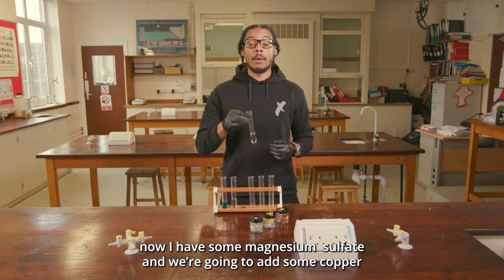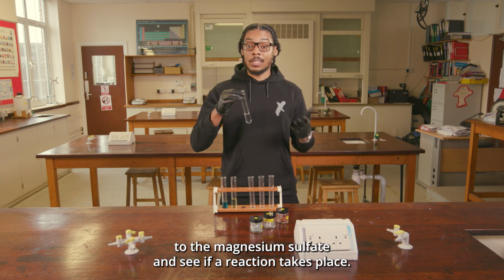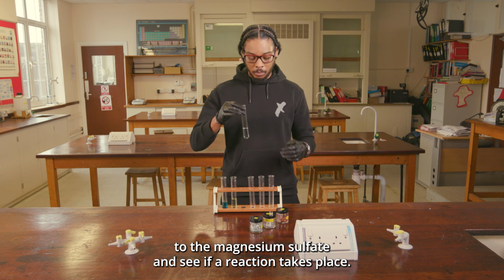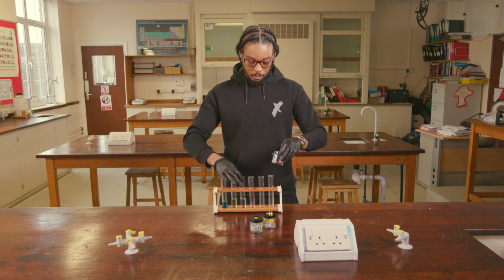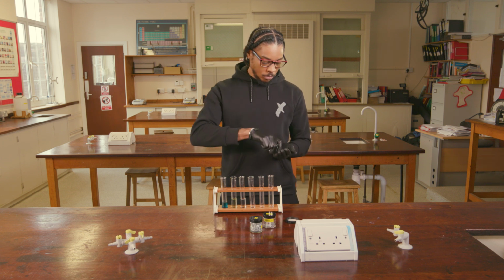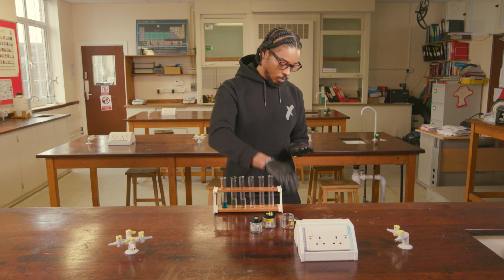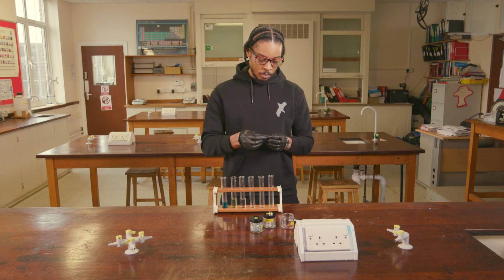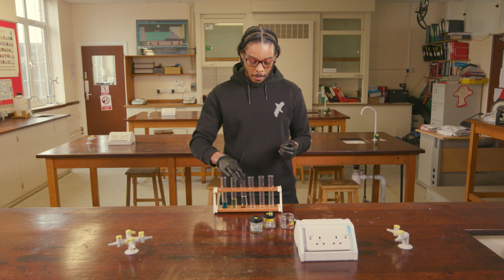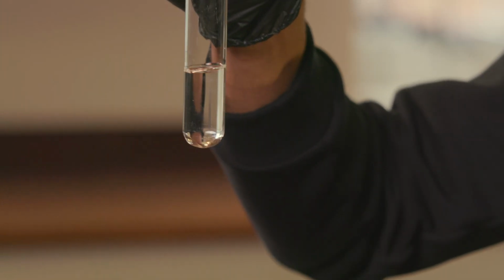Right, now I have some magnesium sulfate, and we're going to add some copper to the magnesium sulfate and see if a reaction takes place. Okay, let's put the copper in the magnesium sulfate.